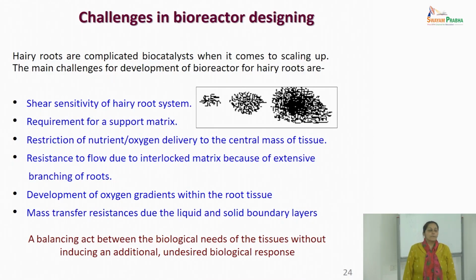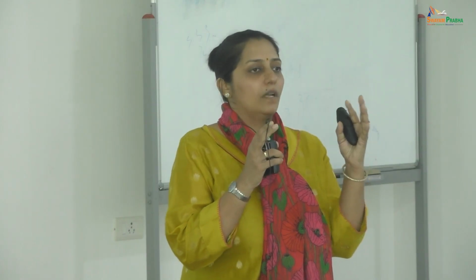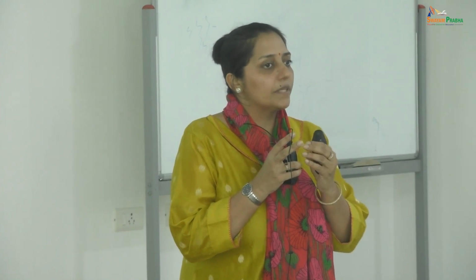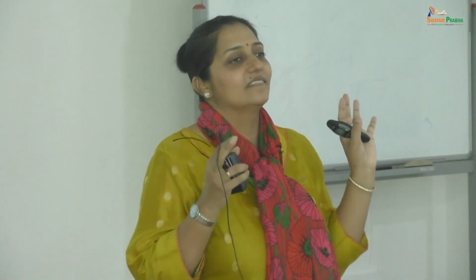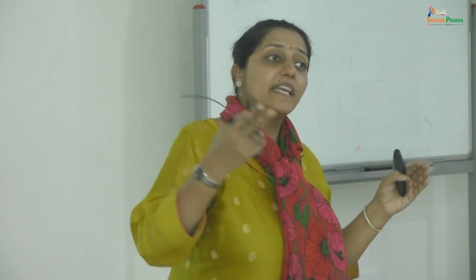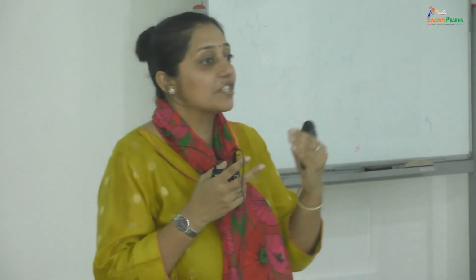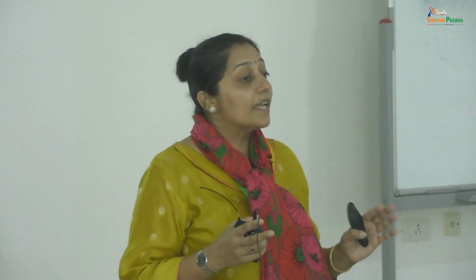Now, when I said, especially in the case of organ cultures, that it will grow like a rough ball with all mesh, oxygen will be one of the critical components. After harvesting, if you open up that ball, you will see that the inside core is dead, necrotic. So if you can find a way, during the entire cultivation, for oxygen to keep flowing in, with no limitations till the inner core, you may be able to improve your biomass productivities and product productivities.